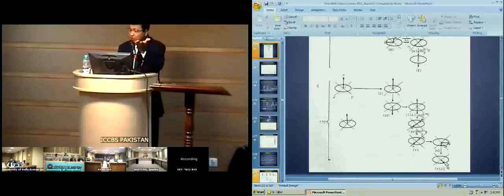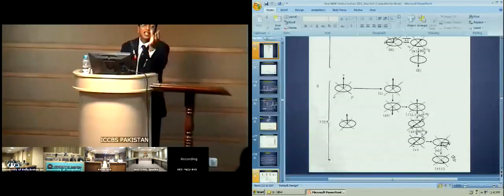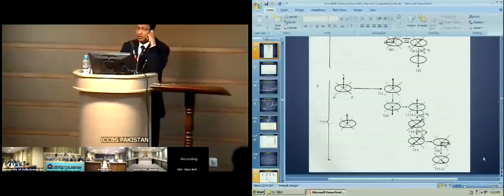And if you want to make sure that all your protons, CH3, CH2s and CHs are on different phases, you do exactly the same as you have done, and add an APT after that. An APT experiment is added to this situation.